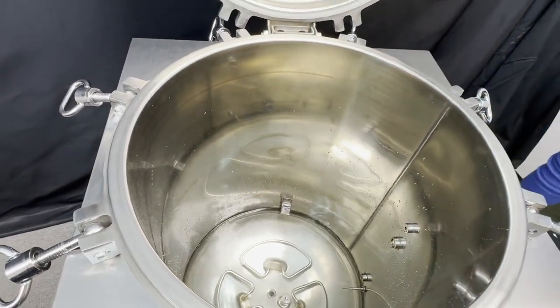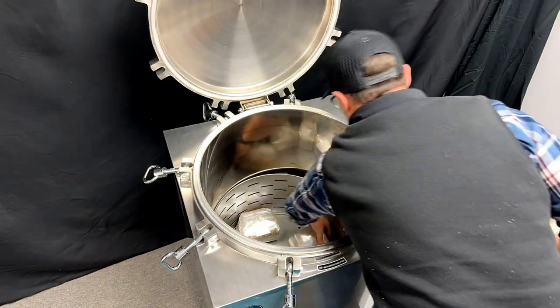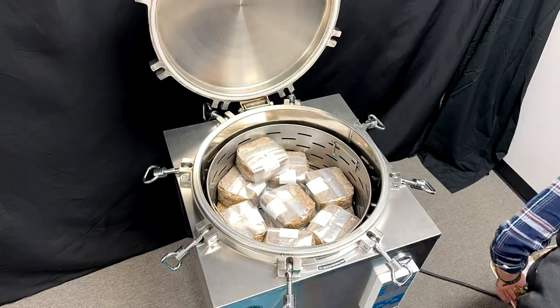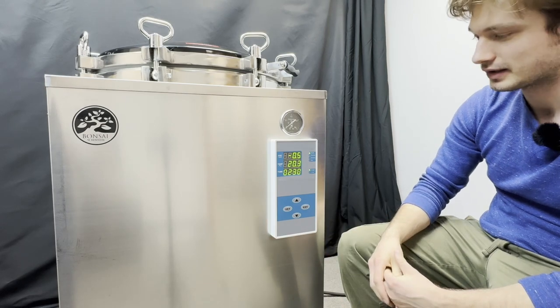Our water level indicator should now indicate that our water level is high. Now we're going to program our autoclave for our grain sterilization cycle.